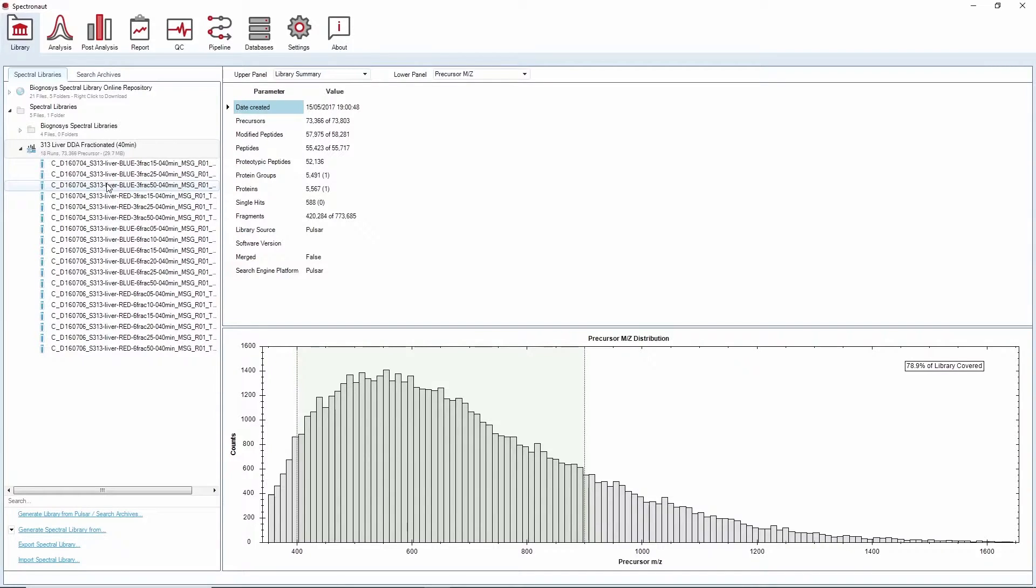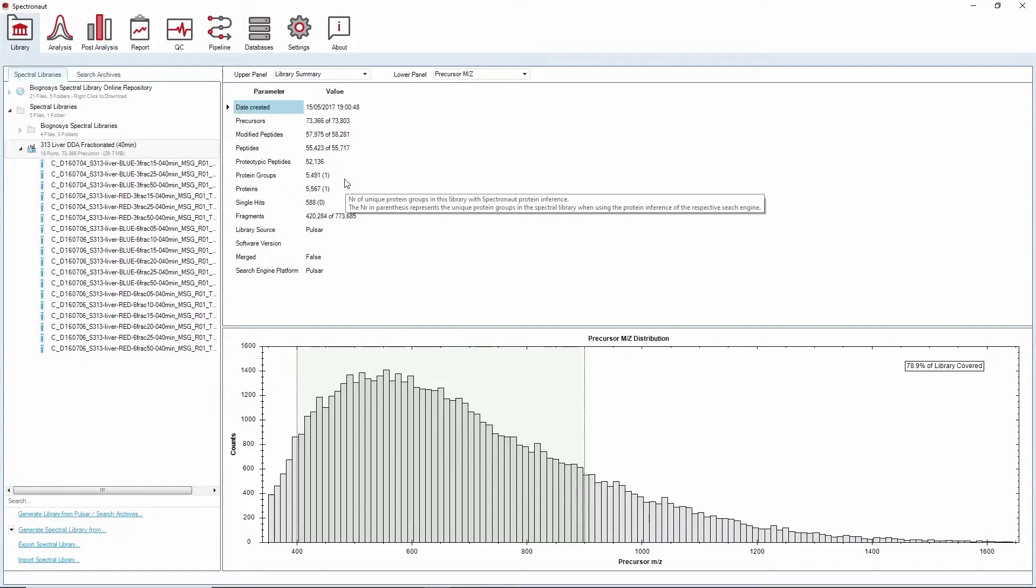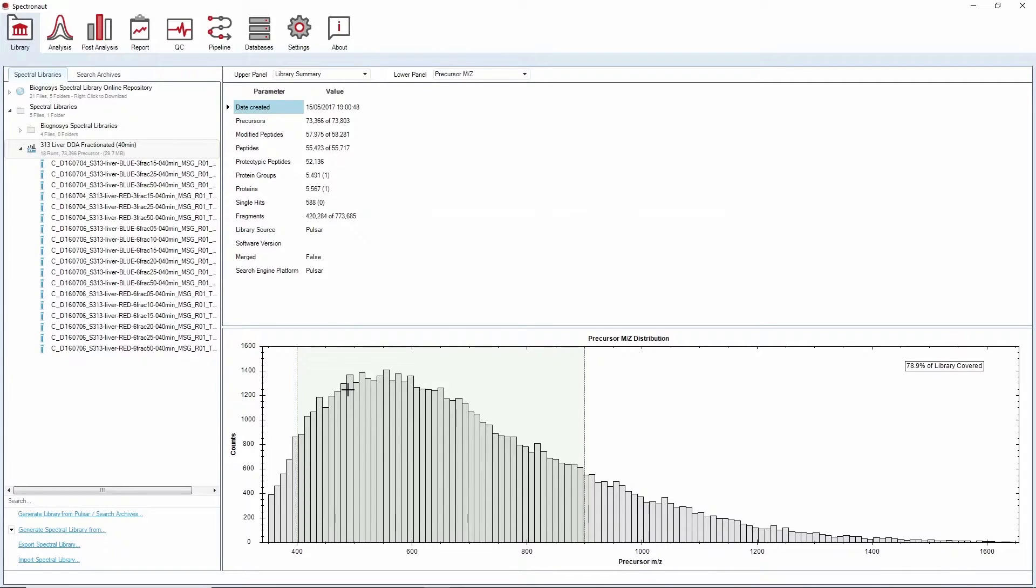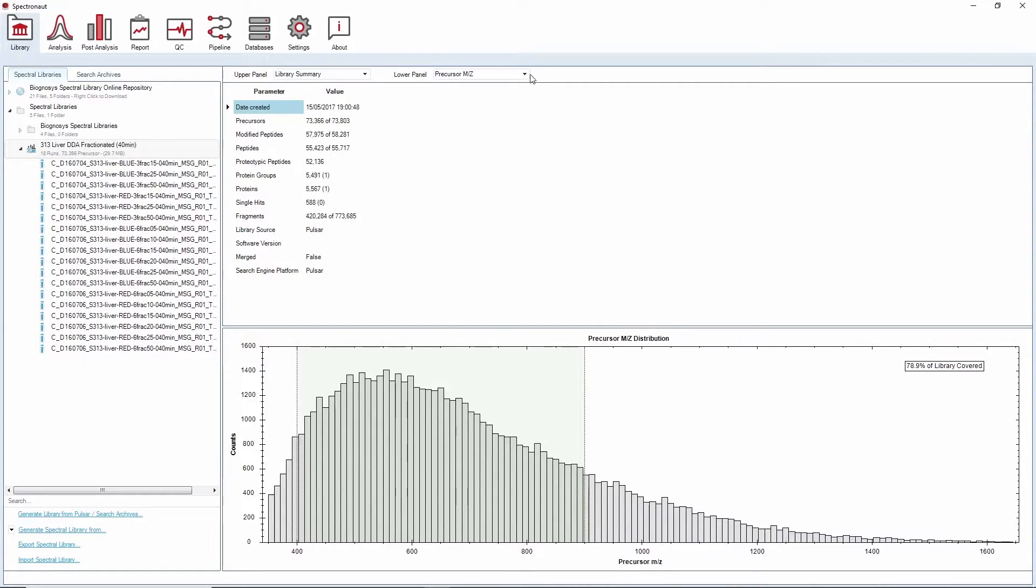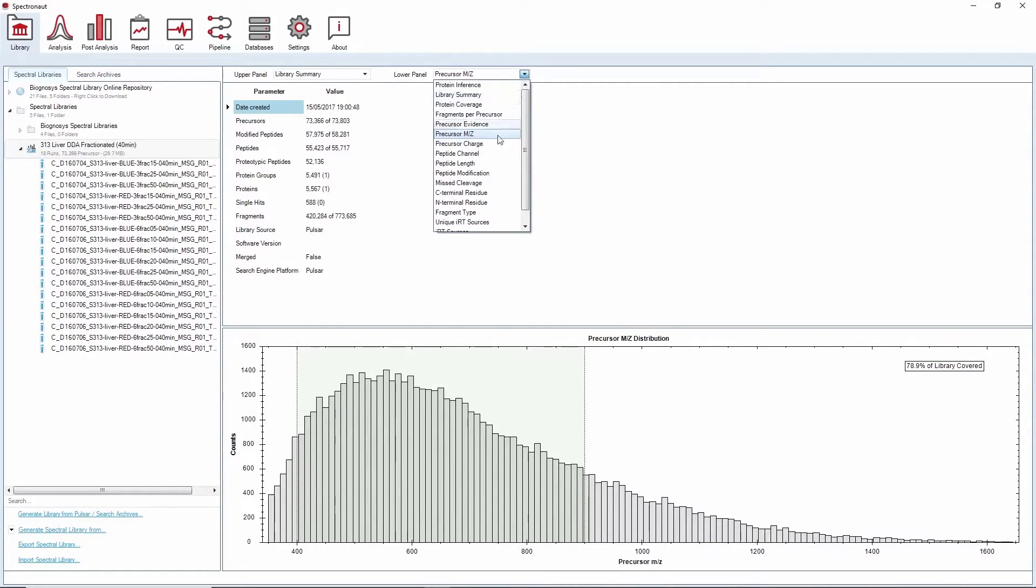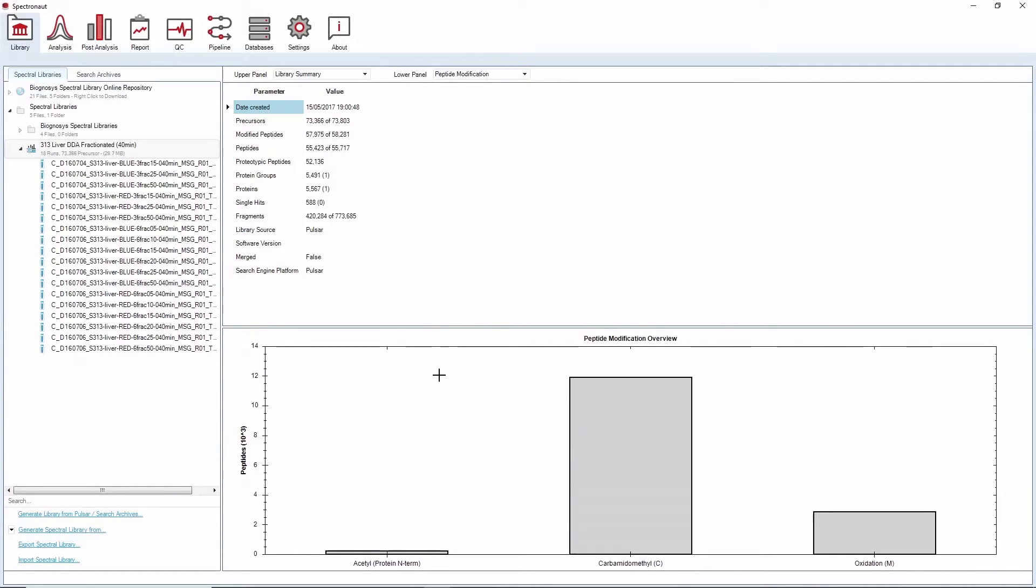Spectronaut offers several options for library exploration. For example, the library summary provides the number of precursors, peptides and proteins compiled in the library. The precursor MZ plot shows the precursor MZ distribution covered by your library. The peptide modification plot shows how many peptides in your library carry post-translational modifications.